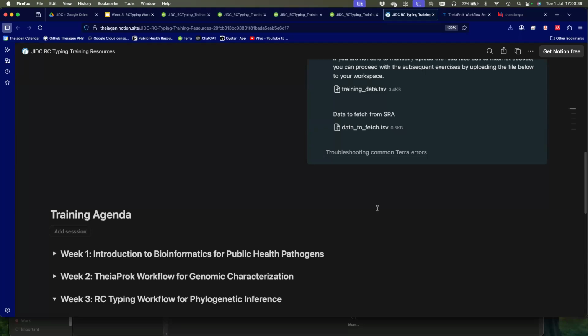And remember, QC is a broad way of saying, are they the right pathogen? Are they the right assembly length? Are they the right GC content, and those sorts of things? And then you select the samples that you think pass QC. Again, remember this is genomic characterization. So for Vibrio, we had O1, O139. We have El Tor, we have the classical type.